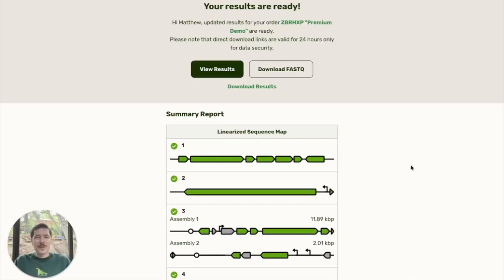Hello there, and welcome to how to interpret my Plasmidsaurus sequencing results. This video will be a brief walkthrough on how to interpret my Premium PCR results directly on the Plasmidsaurus website.